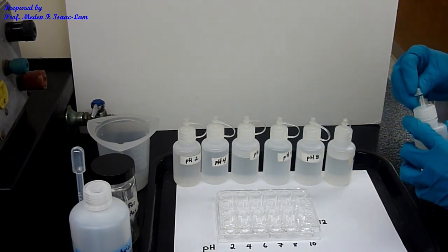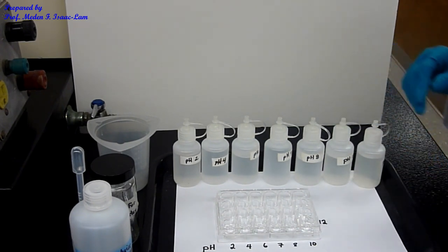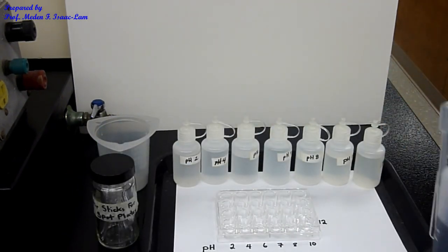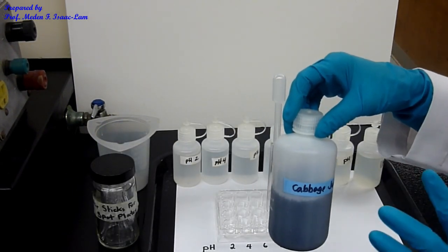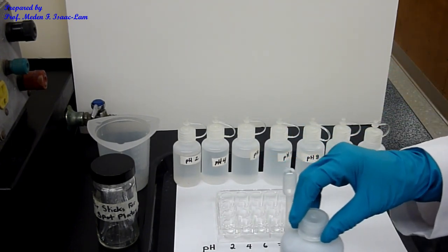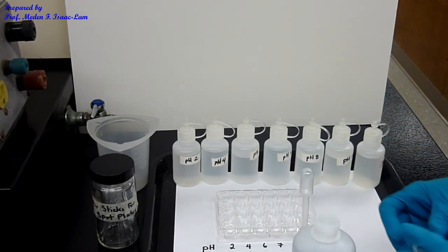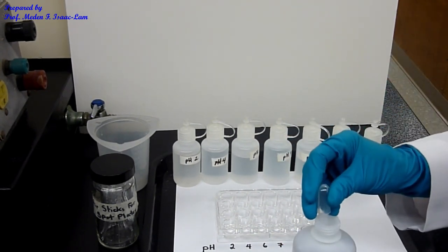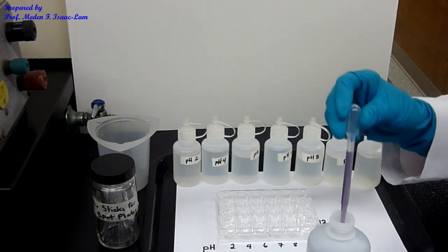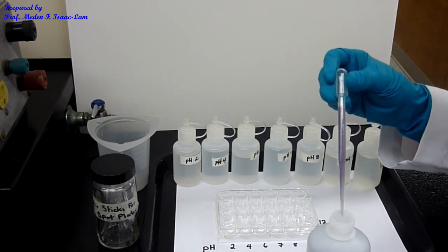Okay, so now we are going to put in the cabbage indicator. It's about 20 drops. The cabbage juice is an indicator and it's purple, because this is actually red cabbage. So we're going to put about 20 drops into each of the wells.